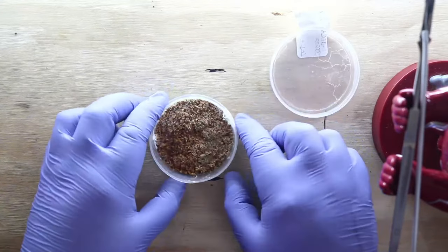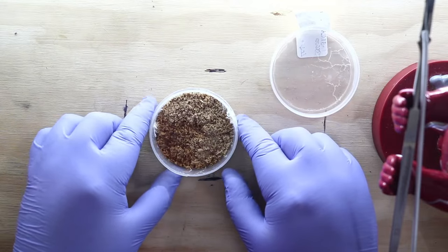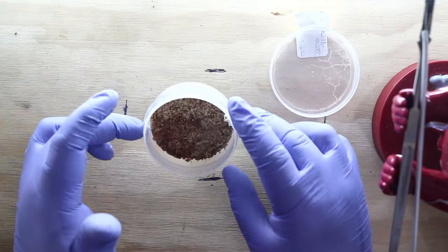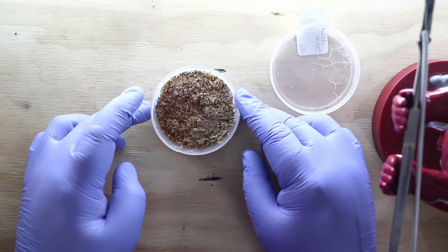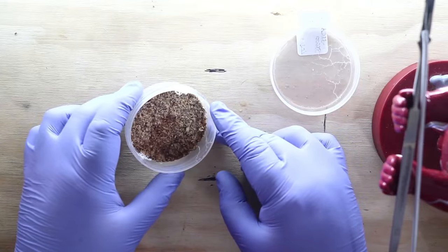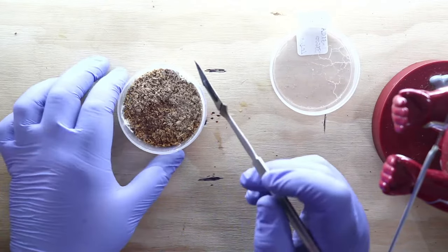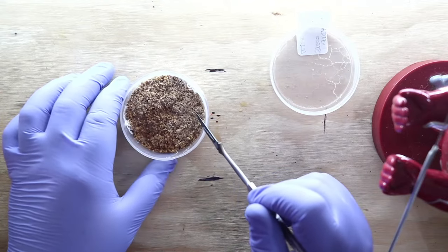Boy, it smells good. So this is just sterilized sawdust. Basically, I put sawdust pellets in here, I wet them, close it up, pressure cook the whole dish, and now I have a dish here for cleanups, just ready to go. I keep them stacked up and ready. And then what you can do is take your sample and place it on one side, and then let it grow.